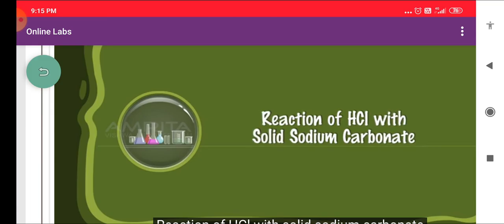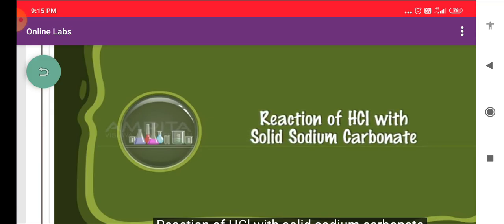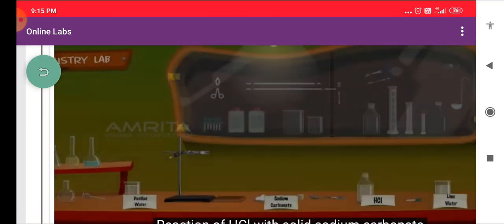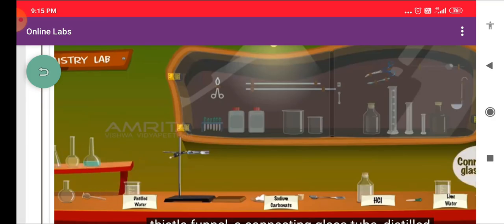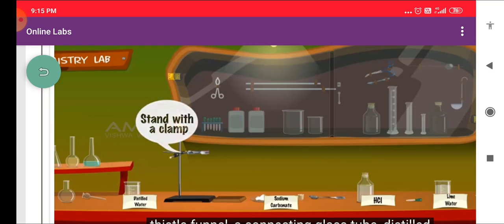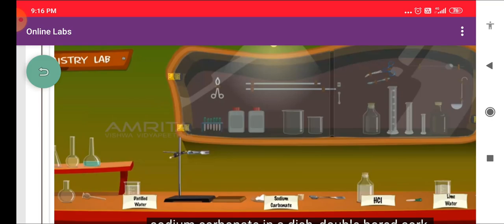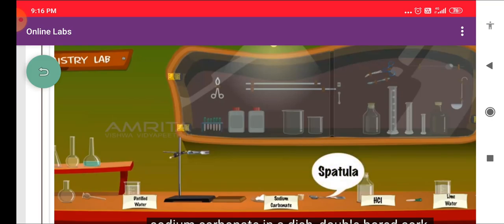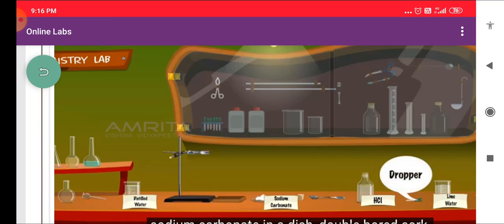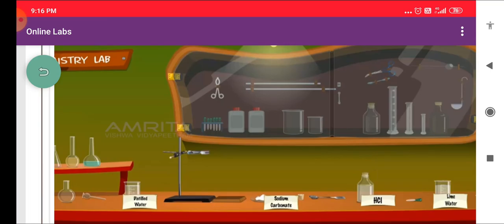Reaction of HCL with Solid Sodium Carbonate. We require a flat bottom flask, a thistle funnel, a connecting glass tube, distilled water in a beaker, a stand with a clamp, some sodium carbonate in a dish, a double bored cork, a spatula, HCL solution, a dropper, and lime water in a beaker.